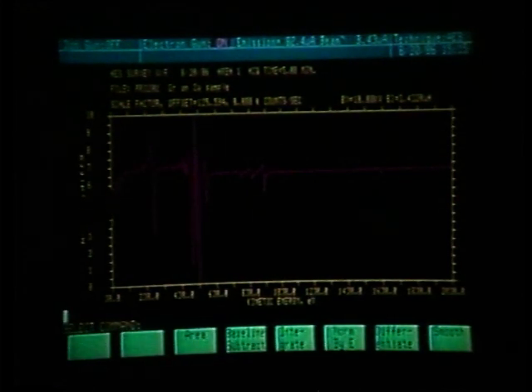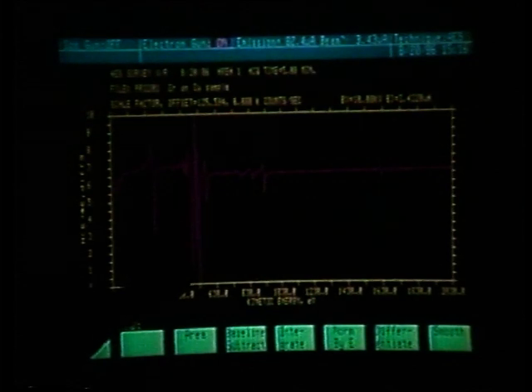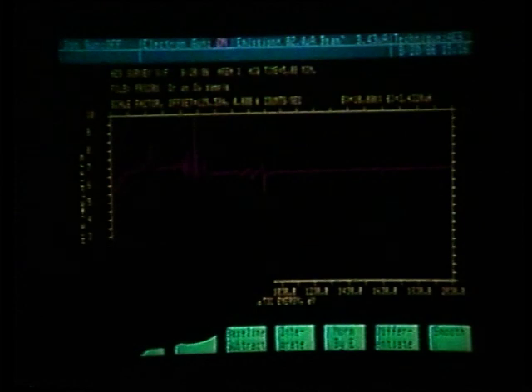This is now our differentiated spectra. We see that on the surface we have carbon and oxygen. The oxygen is located between the two chromium peaks. We also have copper, and we see some indication of silicon.